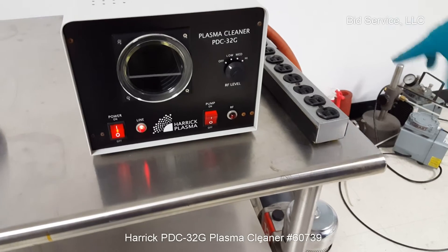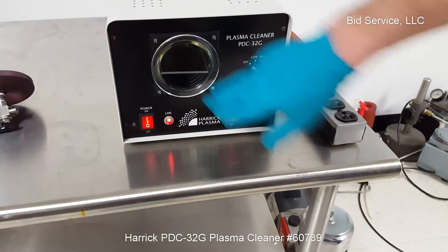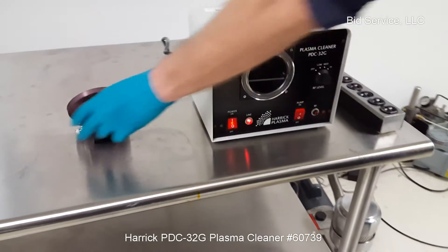Now there's no valve between the pump and the chamber, so as soon as you turn the pump on you're going to start pumping your chamber out. I'll do that now.